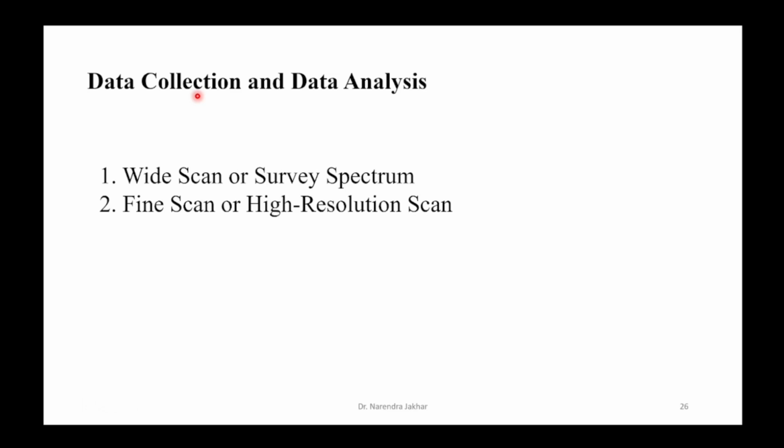So in this section, we are going to talk about the data collection and the data analysis. We will take some examples from lab journals, and we will know about the different names of software in which we can record the data or analyze the data.